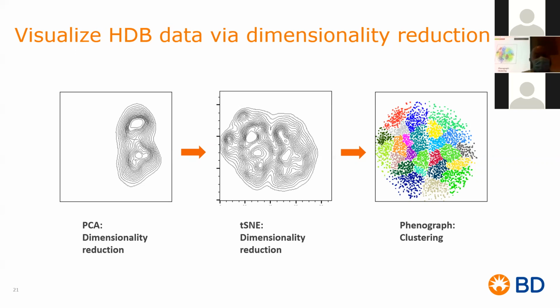But I first do PCA. Now you may be wondering, how come in flow cytometry, when I'm running a high parameter experiment, I never run PCA, but you're asking me, Christian, to run PCA on a multiomics experiment? The reason is because when t-SNE was developed, it still can't handle a very high number of parameters. It just doesn't do well with that. So you need to go back a step and go basically to its parent of algorithms, which is PCA. PCA is a linear algorithm that does not apply to flow cytometry because, again, data is not linear in flow cytometry.